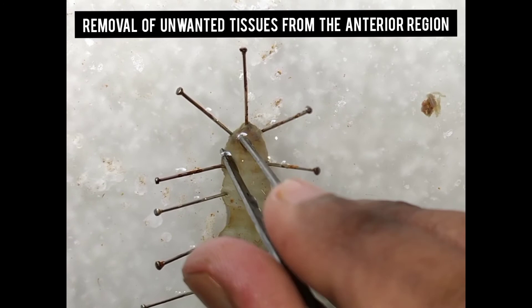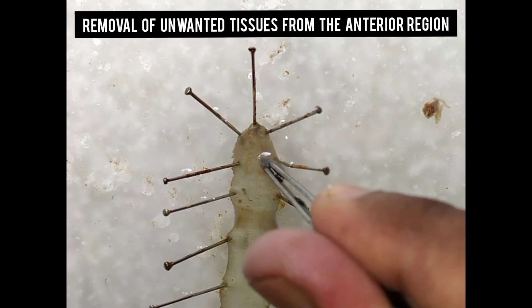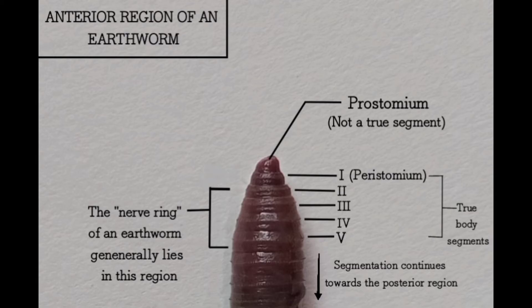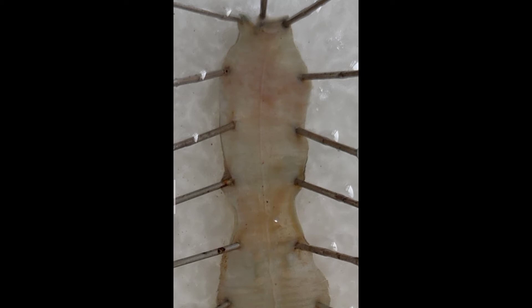The nerve ring can be seen. This is the nerve ring, and this is the ventral nerve cord which runs along the entire body length of the earthworm.